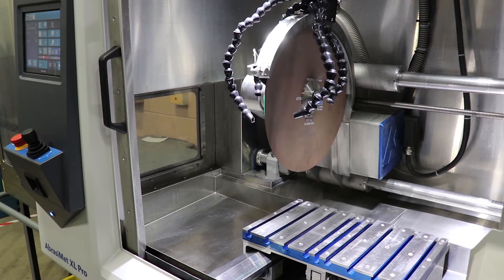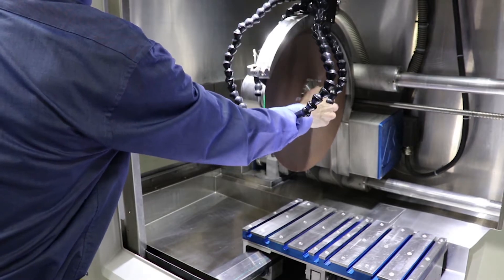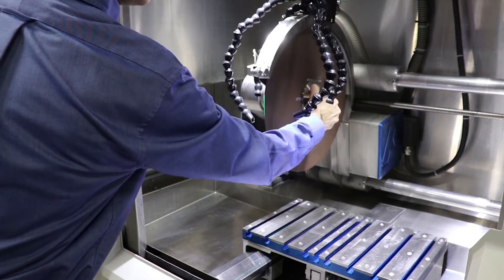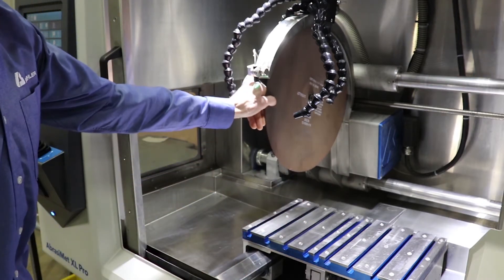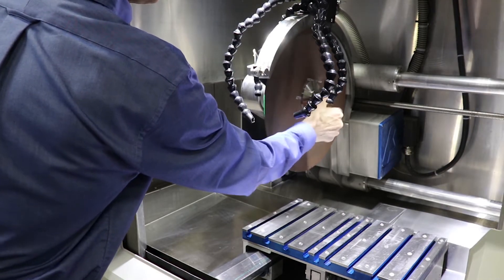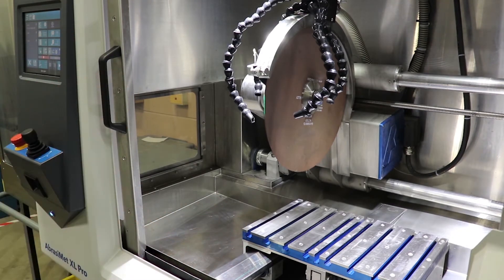We've got a quick-change blade system on here in order to change the blade. There's a quick lock nut here — simply rotate the nut. You can take the nut off without any tools. Remove the flange, take your blade off, install your next blade, put your flange on, and tighten your nut by hand. Again, no tools.